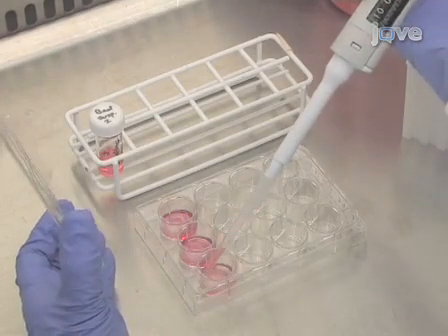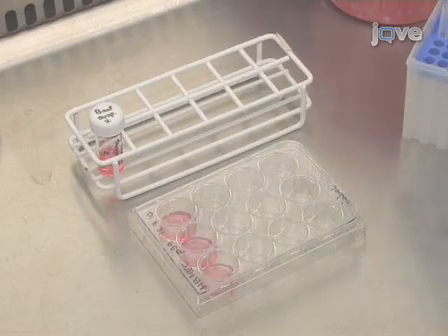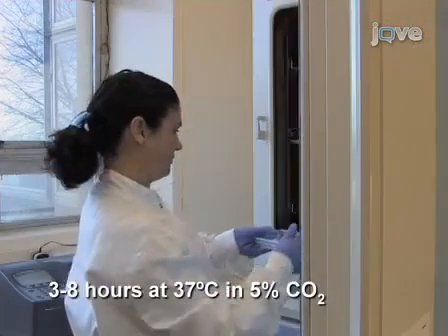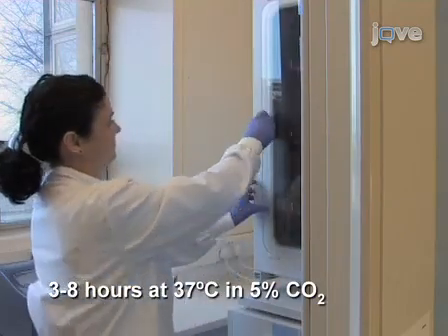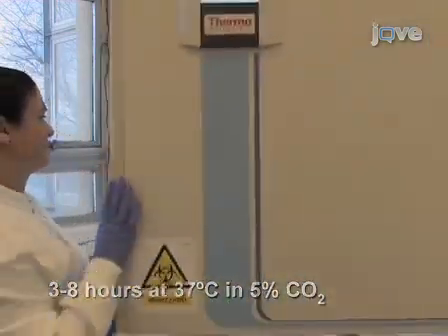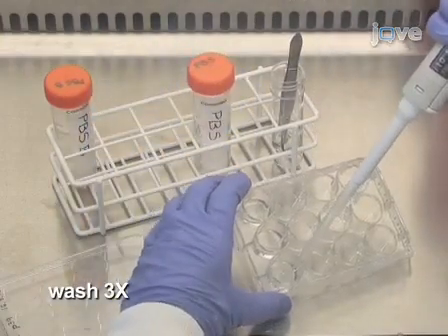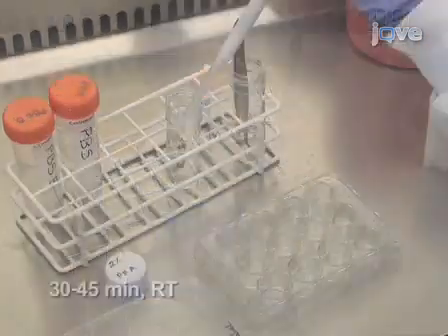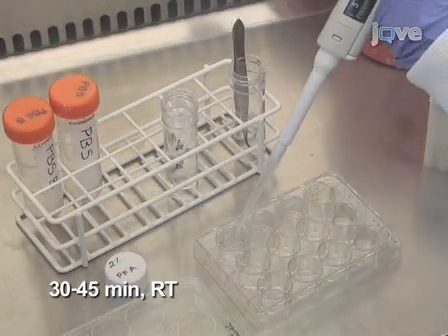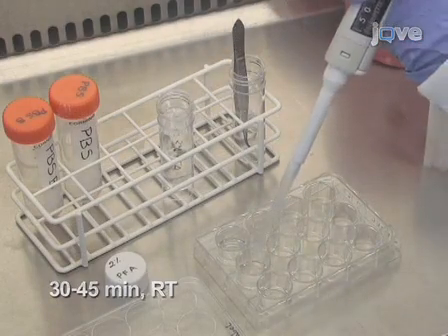In our laboratory, an infection ratio of 200 to 300 colony-forming units per target cell is routinely used. Incubate for 3 to 8 hours at 37 degrees Celsius in 5% carbon dioxide. At the end of the infection period, wash cells 3 times with PBS and fix in 500 microliters of 2% paraformaldehyde for 30 to 45 minutes at room temperature.